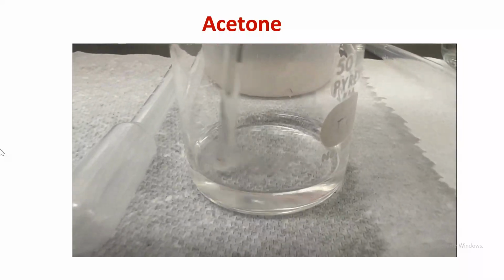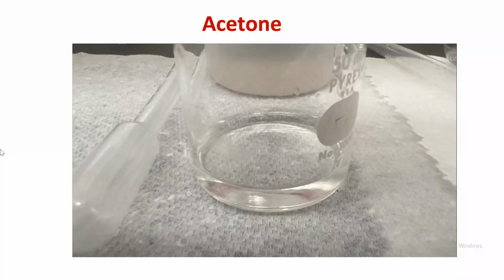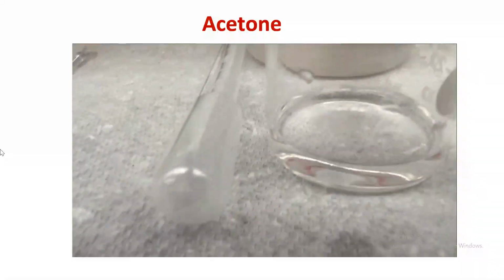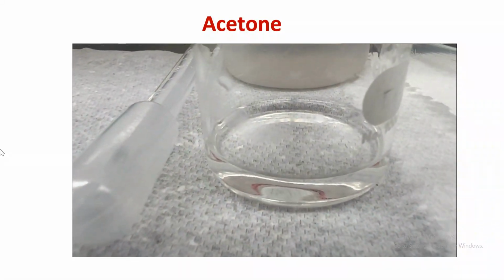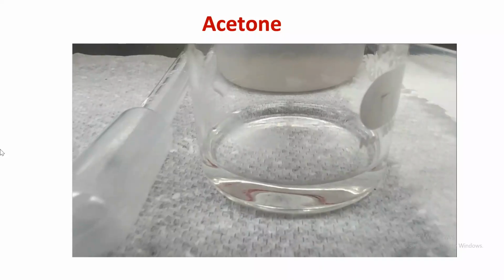All right, so as you can see, I only see one layer. So since it's one layer, you can write no layering. We don't see any layers. It's just everything is one. So no layering, and it's miscible. Miscible means it mixes. And for the density observation, again, no layering. We only see one layer, and the conclusion would be NA.